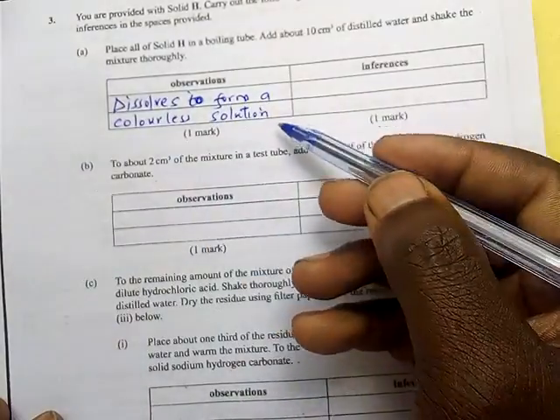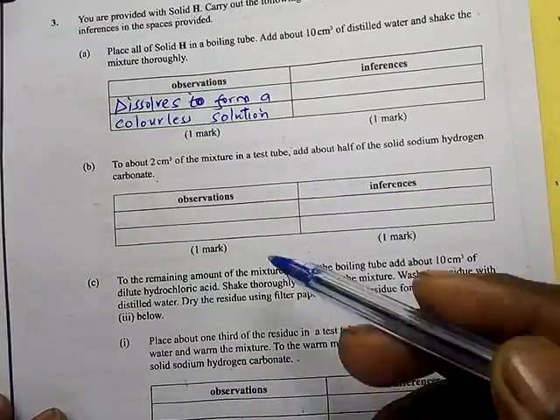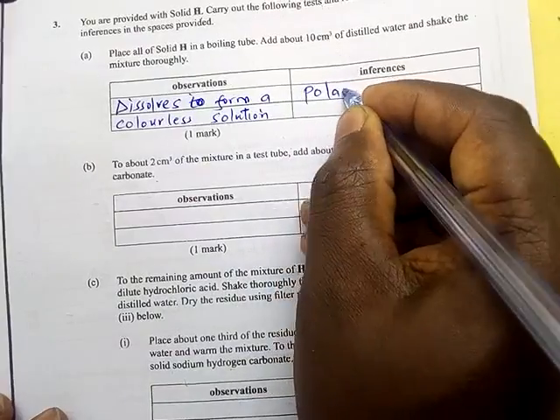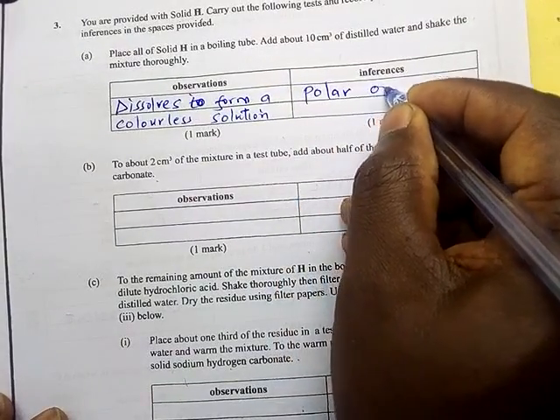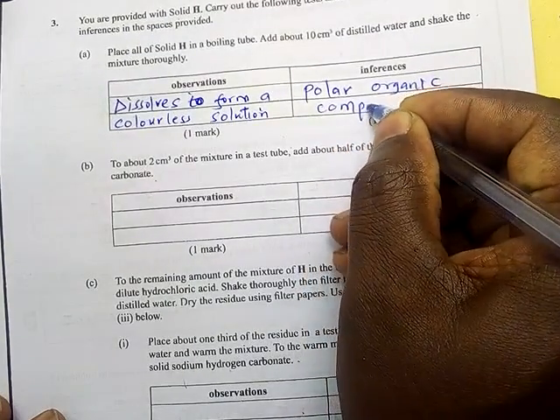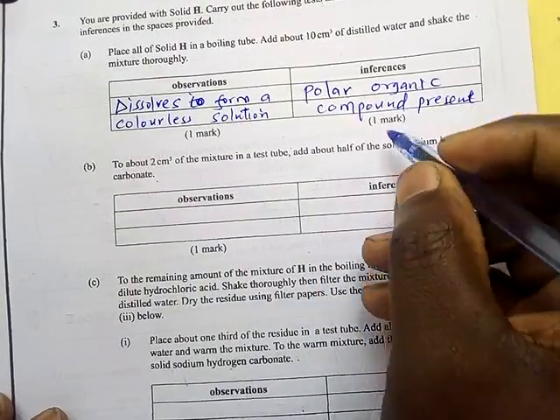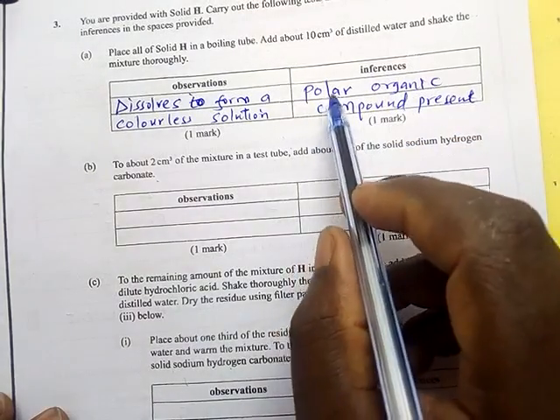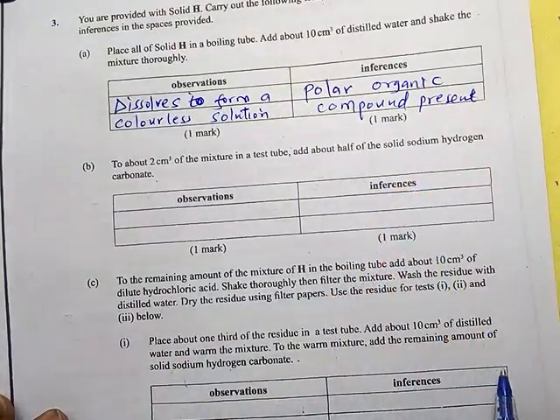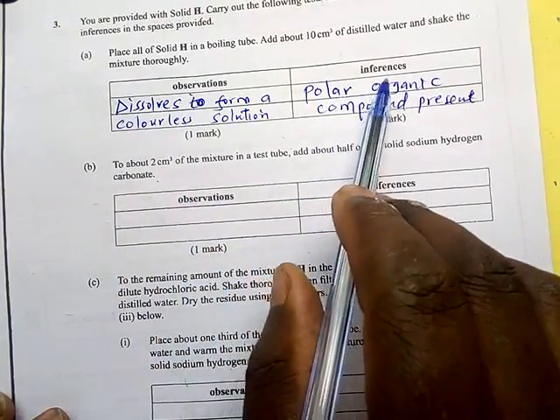So if it dissolves to form a colorless solution, and we have already identified that we are in organic chemistry, then it means that the compound in question is a polar organic compound. It is a polar organic compound present. A substance which dissolves in water is called polar, and the one that does not dissolve is called non-polar. For this one, it is dissolving in water. Water is polar, therefore that compound is polar.